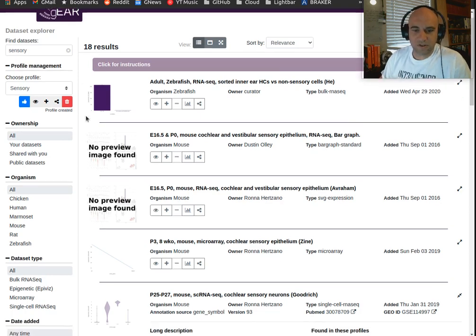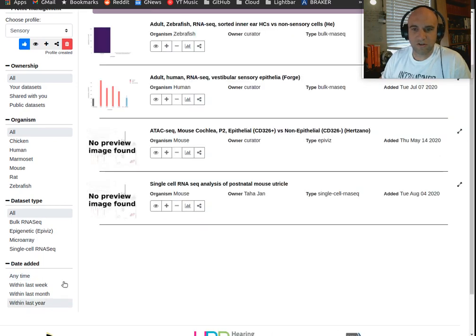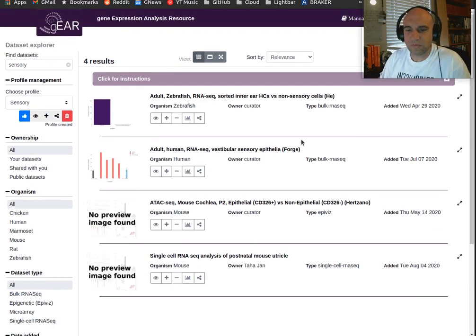I want to see first only those which were uploaded within the last year. So I click this filter here. It refreshes that dataset list, and I see just those. I'd like to add this one and that one to my profile.